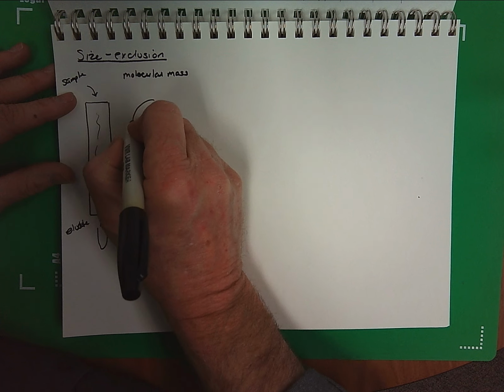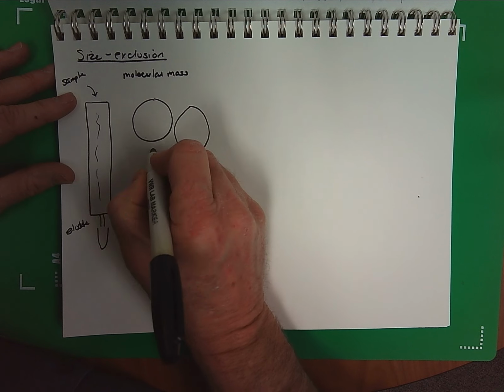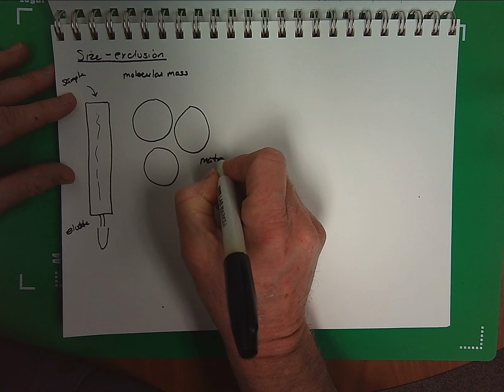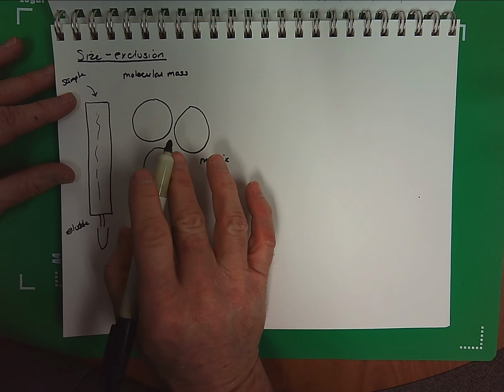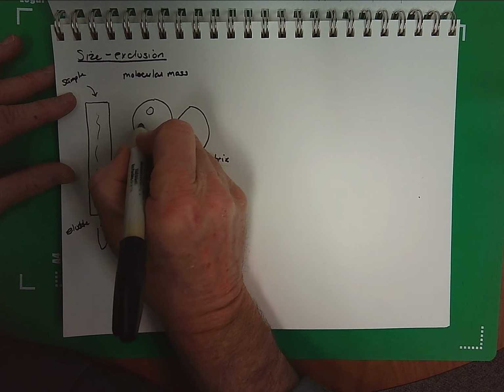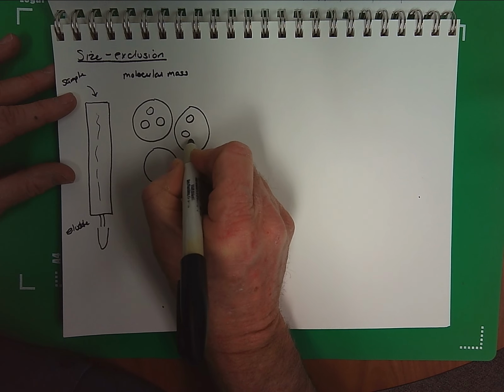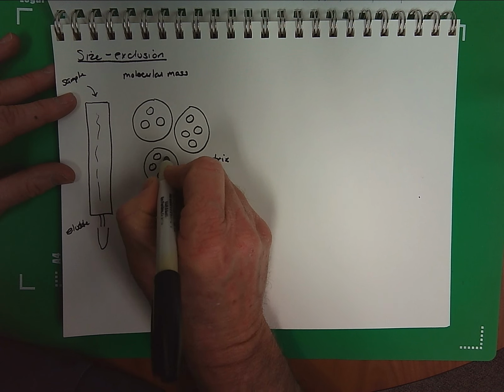So the way this works is we have beads that are once again part of the matrix that is within the column. But these particular beads do not have a specific positive or negative charge. What these beads have are holes. And these holes are of a very precise size.